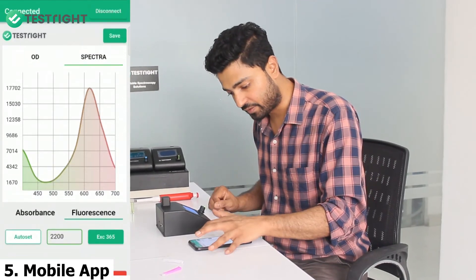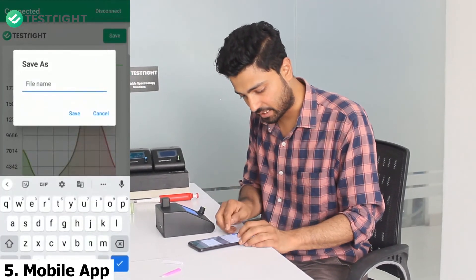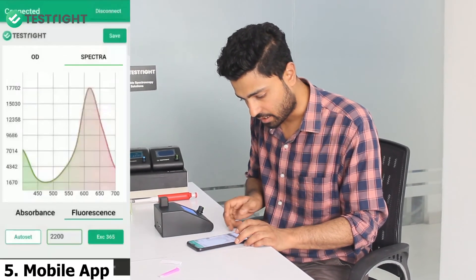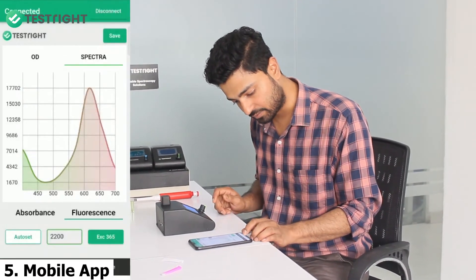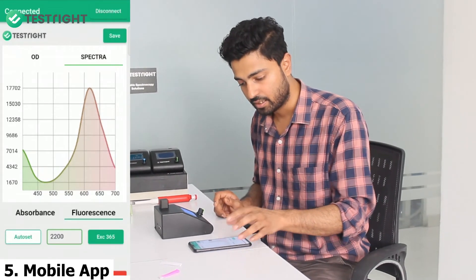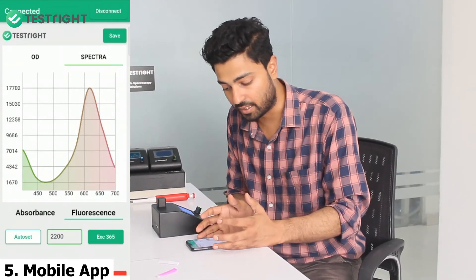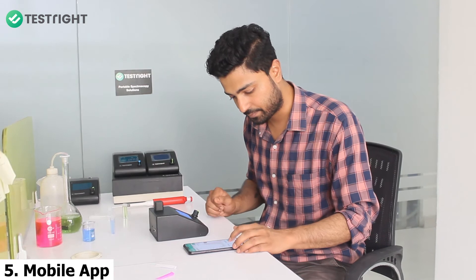You can further save this. Let me save this as rhodamine — it will be saved on the path Downloads/test/rhodamine. You can save this CSV file and send it to your friends, colleagues, or email yourself as per your convenience.